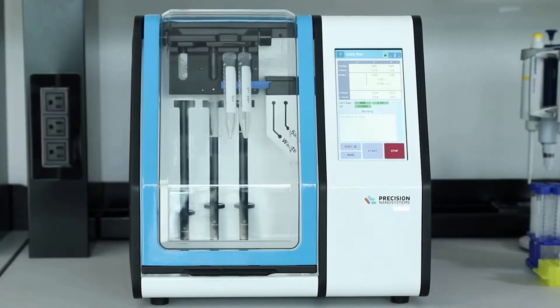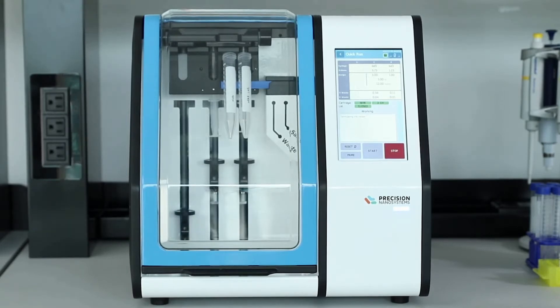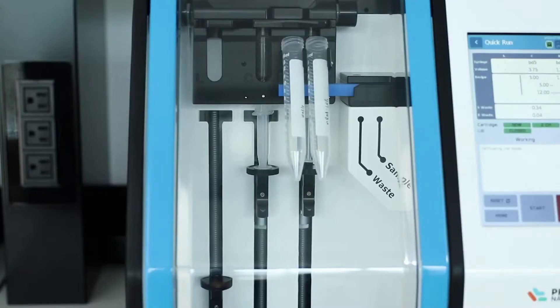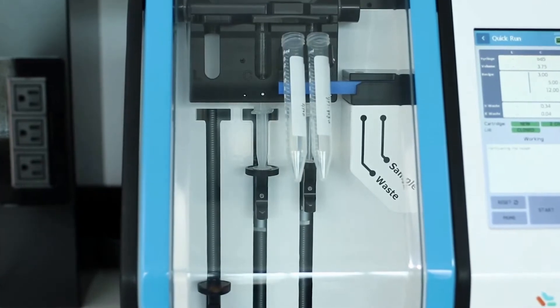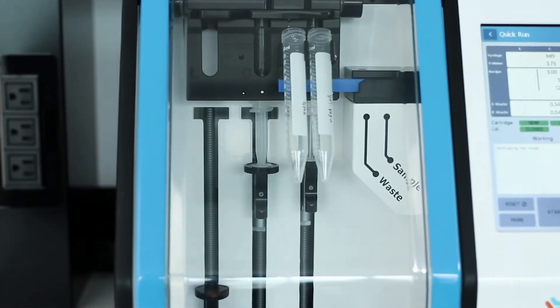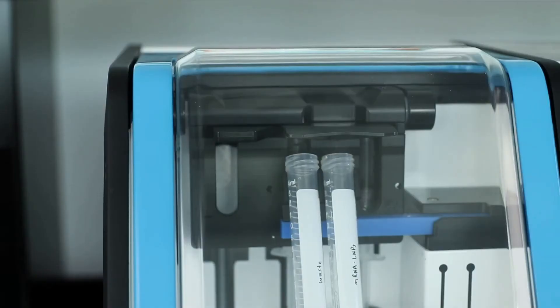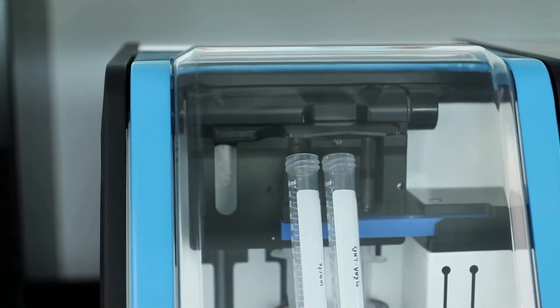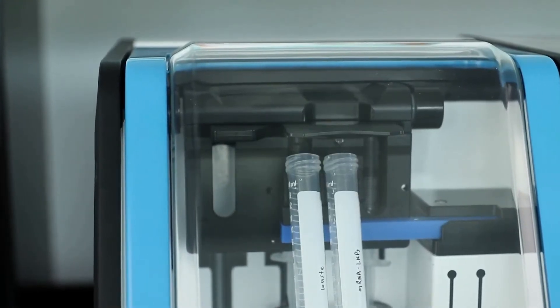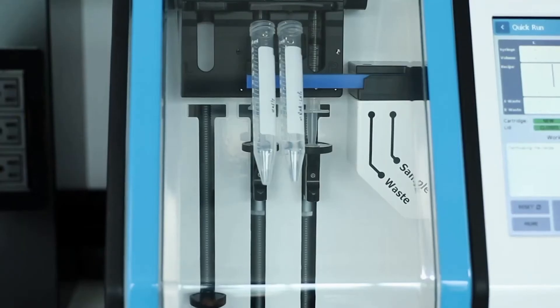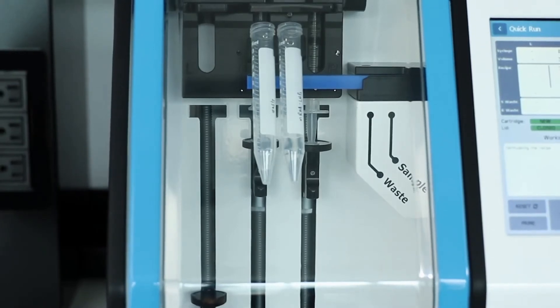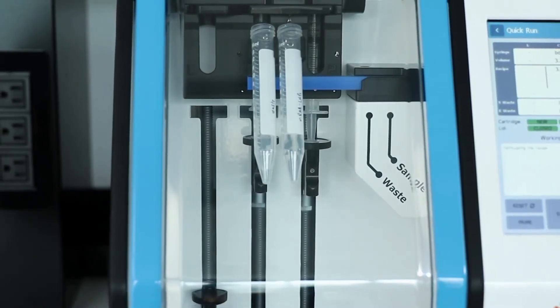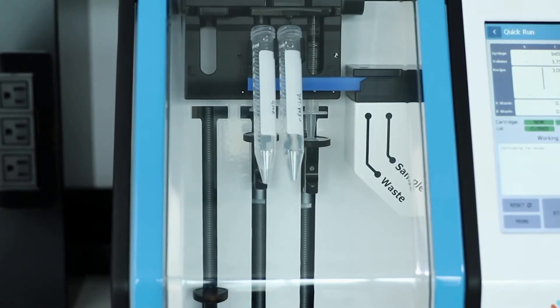Here you can see just how fast Ignite produces this formulation. You'll also see Ignite automatically divert a small portion of the formulation at the head and tail of the process to ensure only the best quality particles produced under steady state conditions are collected. And here you have a 5 milliliter formulation which encapsulates more than enough RNA to meet all the in vivo dosing requirements.